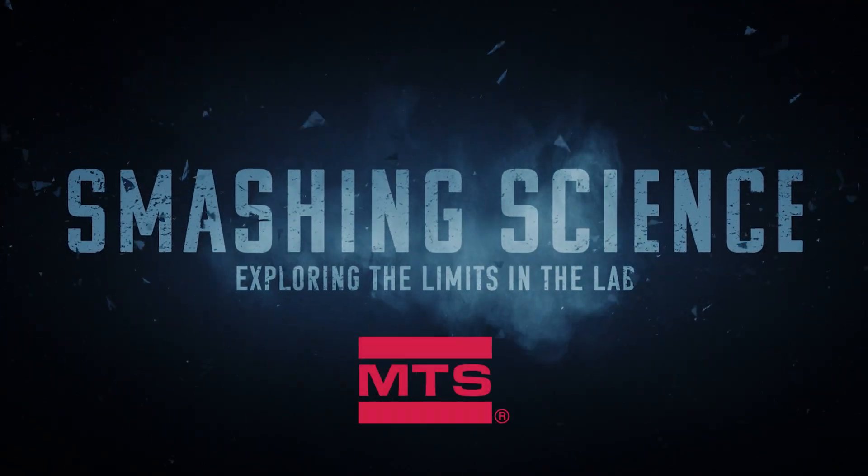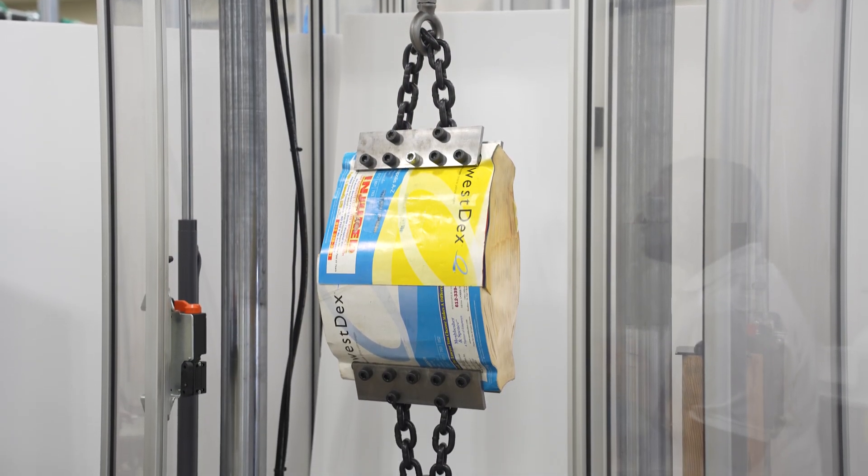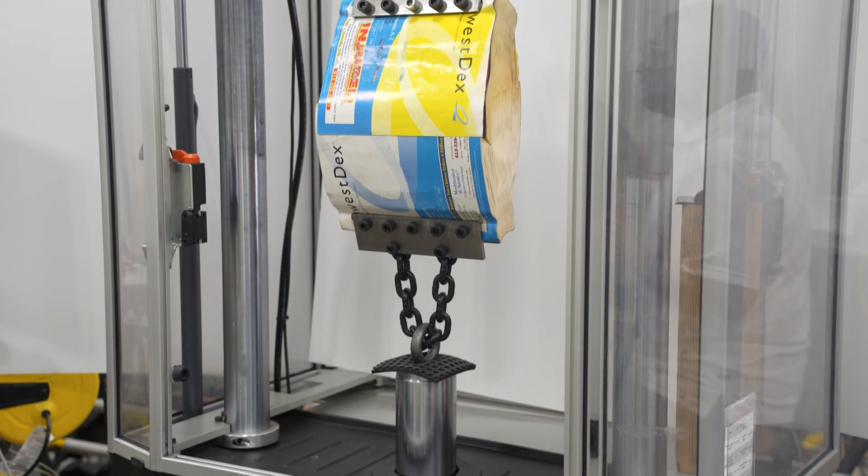Smashing Science — exploring the limits in the lab. Hey, I'm Allie, and on this episode of Smashing Science, we were in a bind over the strength of yellow-page phone books. Using an MTS landmark material testing system, we wanted to see how much force it took to rip apart two interlaced yellow-page phone books. Let's find out.